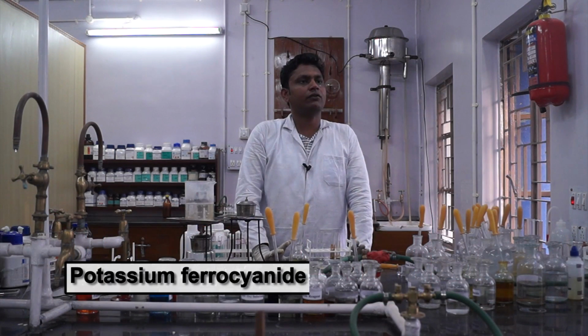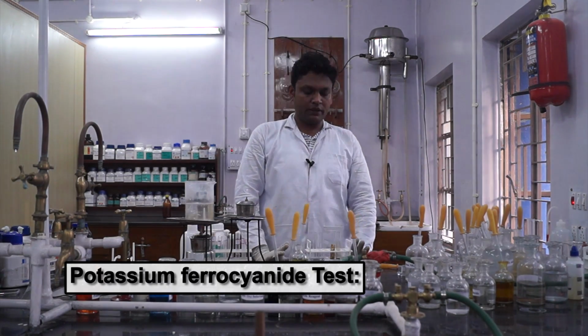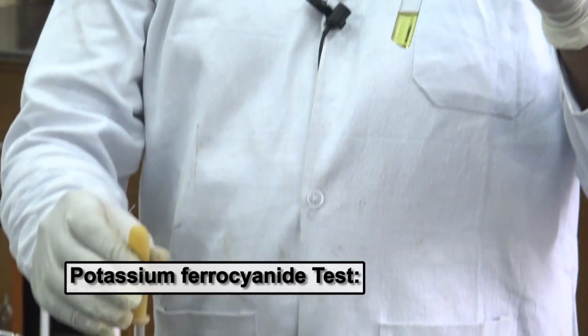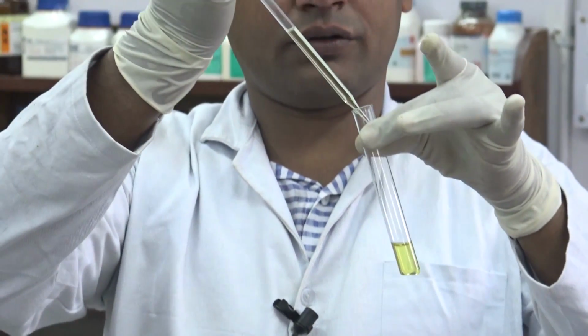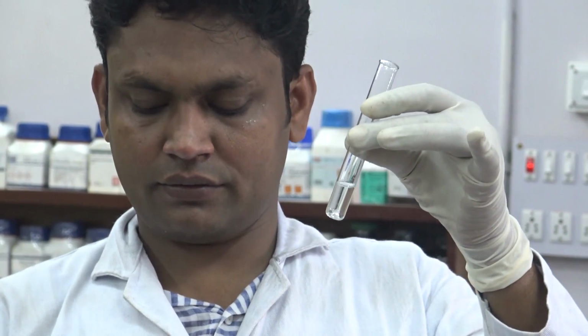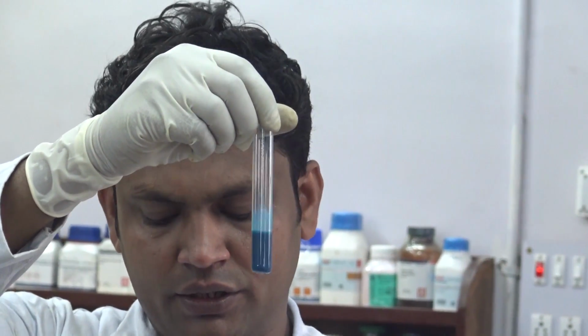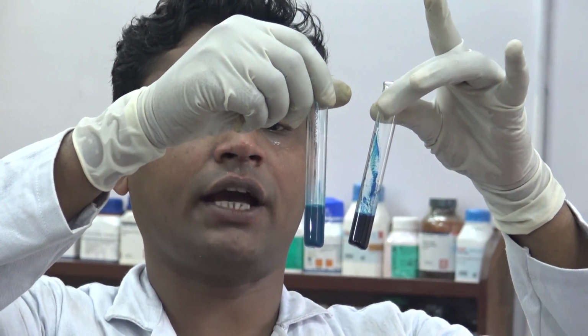Another confirmatory test for ferric or ferrous ion is the potassium ferrocyanide test. For this test we have to take sample solution and add few drops of potassium ferrocyanide solution to it. Prussian blue color precipitate confirms the presence of ferric ion in our solution. Let's see what happens with the ferrous ion using this reagent. With ferrous ion we can also see green or pale blue precipitate which is distinctly different from the ferric ion.